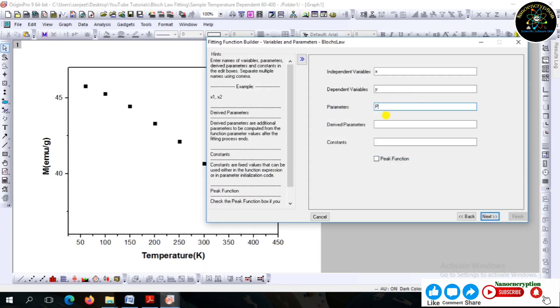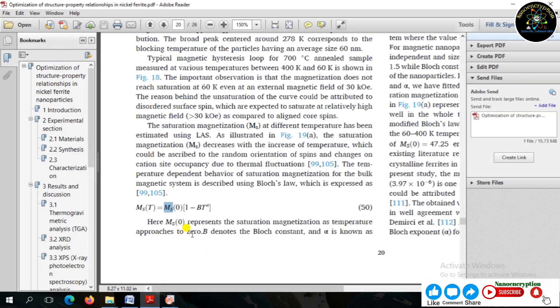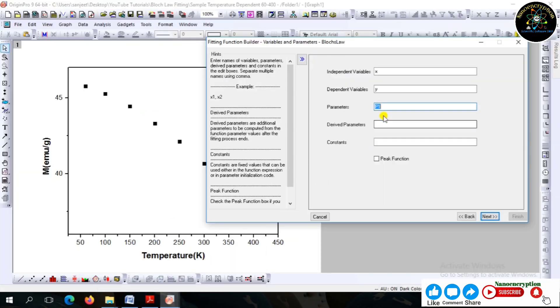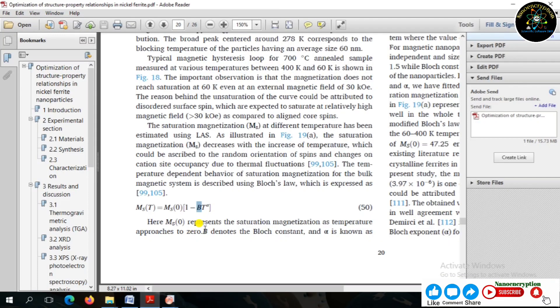Here, P1, P2, and P3 represent saturation magnetization, Bloch constant, and Bloch exponent respectively. In the Bloch law equation, Ms is the saturation magnetization, B is the Bloch constant, and alpha is the Bloch exponent.